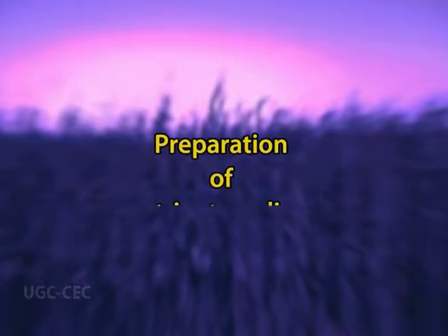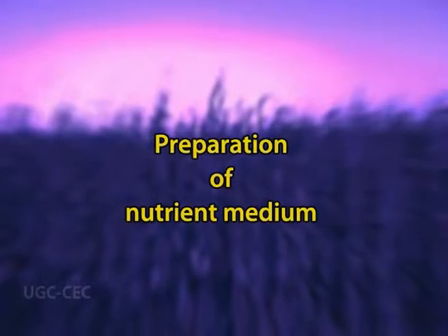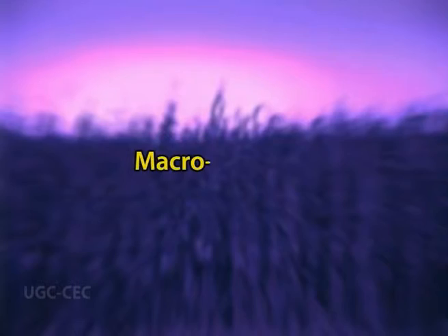The second important step of plant tissue culture technique is preparation of nutrient medium. The tissue culture medium is composed of following components: macroelements. Macroelements are those substances that are used in large quantities.